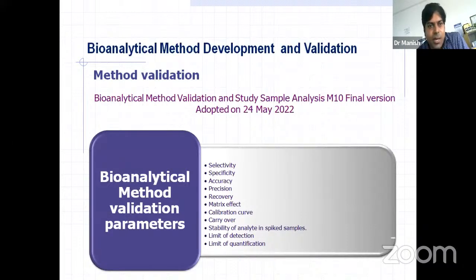You know that we are going for the LLE method. If you take an immiscible solvent, you are going to add it, then we add a little bit of NaCl and undergo centrifugation. So this sodium chloride enhances the withdrawal, breaking the bond between protein and the drug, so that we can enrich the mobile phase with more amount of available drug.